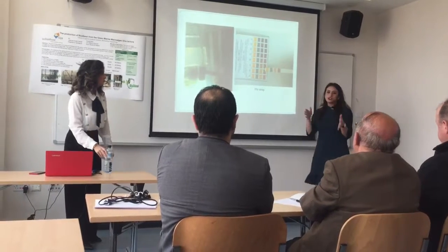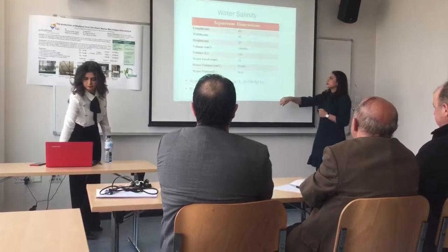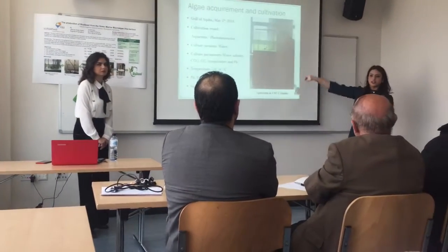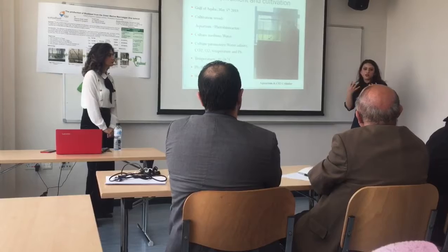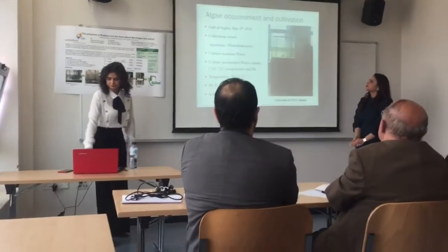No, CO2, we use the CO2 cylinder. Oh, can you go back 2 slides? Here you can see, it's not really showing. There's a CO2 cylinder. It supplies them with CO2 for photosynthesis. And the pump, because when they photosynthesize, they release oxygen, and the pump allows the oxygen to mix with the organism.